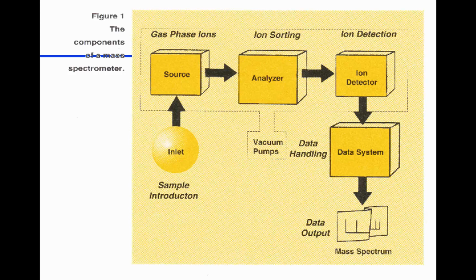Well, the mass spectrometer has to operate under a vacuum. We're pretty happy in our lab if we can run around 10 to the minus 7 torr. We had a sample analyzed for us at a company south of the city. They're doing 10 to the minus 10th torr. Now that's remarkable vacuum. The better the vacuum, the better your data. And so that's absolutely required. Because what we're doing up here is we're creating ions, and those ions have to live to go through their separation to be detected. And if there's any air in the system, those ions run into air, and they're neutralized.